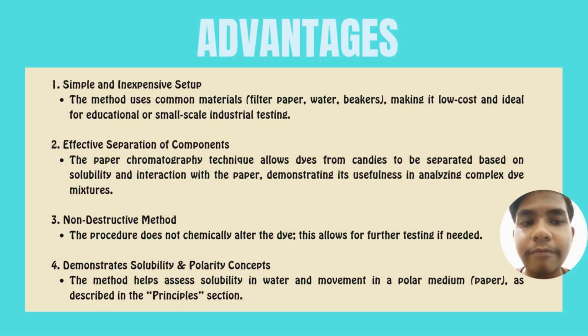Third, non-destructive method. The procedure does not chemically alter the dye. This allows for further testing if needed. Fourth, demonstrates solubility and polarity concepts. The method helps assess solubility in water and movement in a polar medium, which is paper, as described in the principle section.